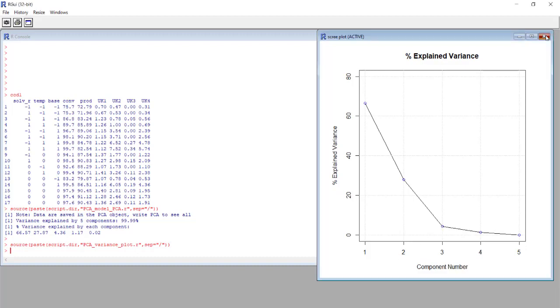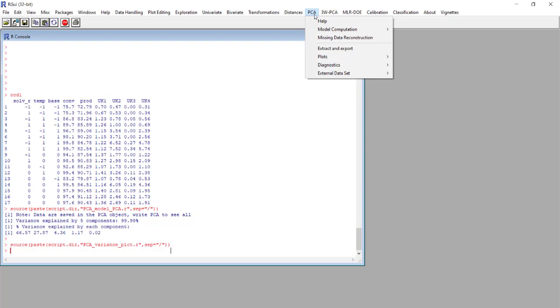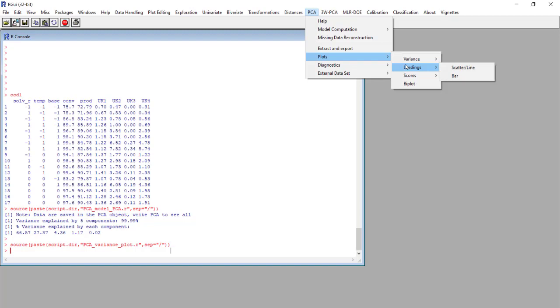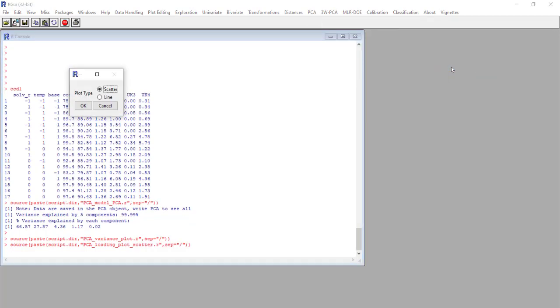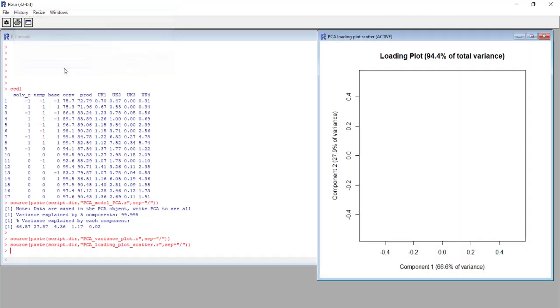Another kind of plot that is really useful, again in PCA plots, is the loadings plot and we select the scatter line plot type, again scatter. We select the first two components to be used as x and y axis and in this case we select the column names as tags of the point.